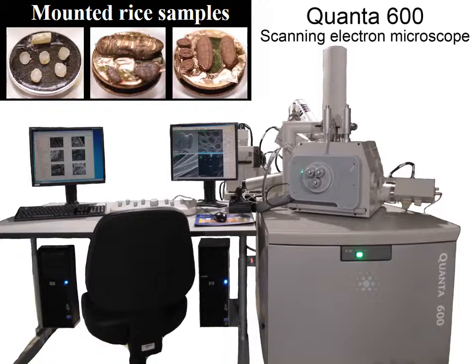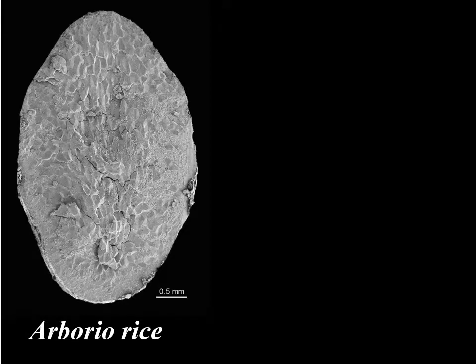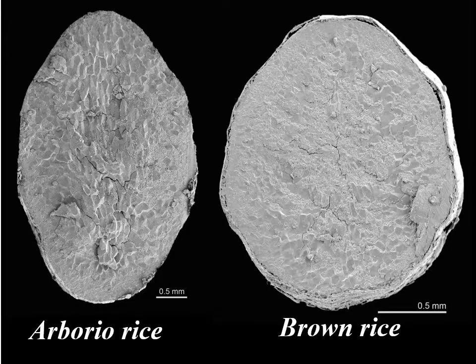The samples in the microscope are manipulated by the microscopist to reveal the structures of interest — in this case, the interior of a rice grain. Cross sections of two different kinds of rice are shown: Arborio rice at left and brown rice at right. The micrographs are shown as the microscope has produced them, but the surroundings of the grain have been turned black. The grains are compact with tightly packed endosperm, that is, starch granules.